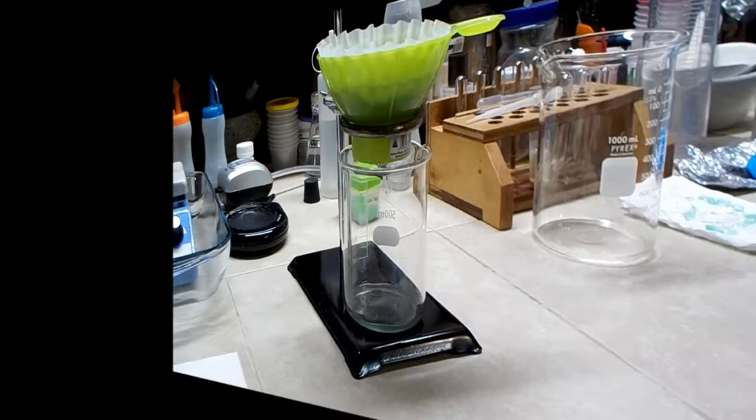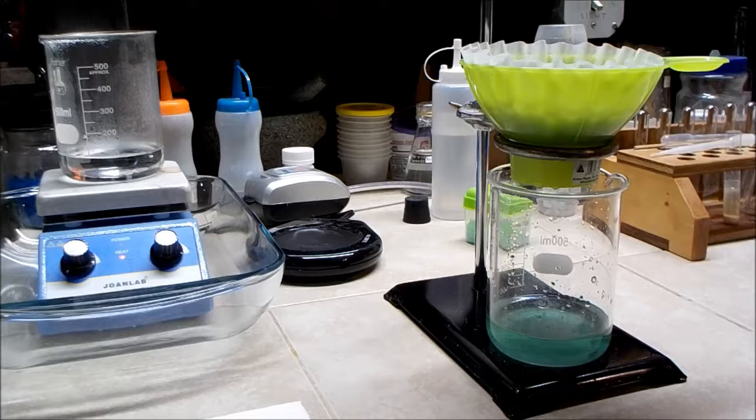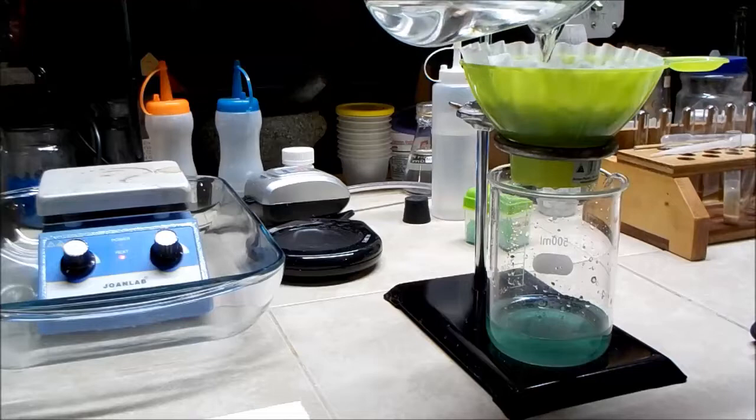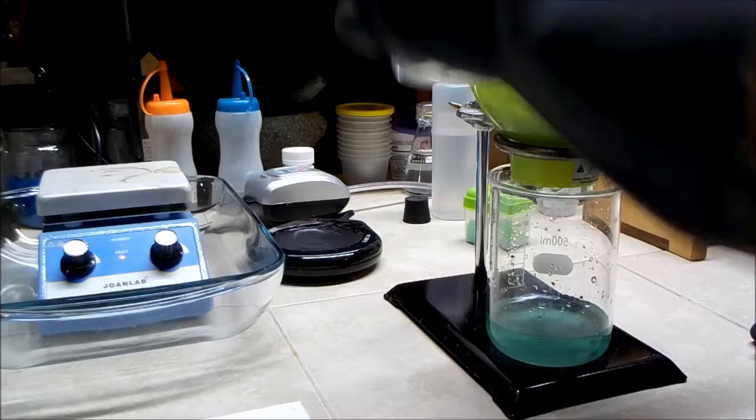So it looks like my filter paper is clogged and it's nearly stopped. Part of the problem is that it started to crystallize once I dumped it into the filter paper. So I'm going to see if I can get it to go. I've got another 100 milliliters of hot water here. Let's see if that redissolves some of those crystals and gets things going through the filter again.